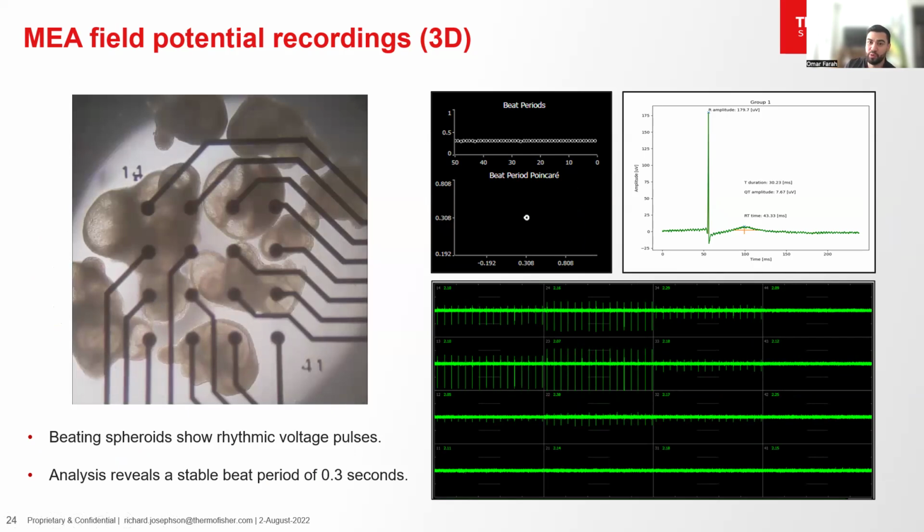But we've also used some more sophisticated instrumentation to look at depolarization and T-wave patterns, right? Where we can see how these cells polarize, depolarize and repolarize as well. Again, giving us a really cool model to study different cardiac functions or pathologies as well.